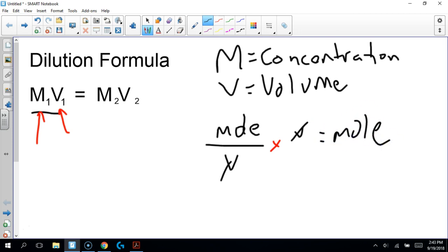Why chemically this works is because when we took the solution and we added, let's say it was blue, so we had the blue solution, okay? There was a certain number of moles of the copper sulfate in here, okay?